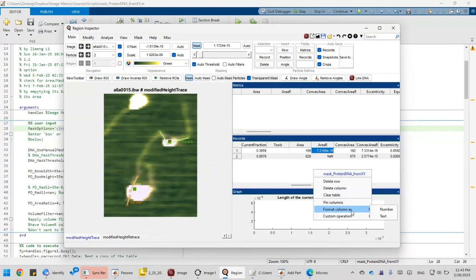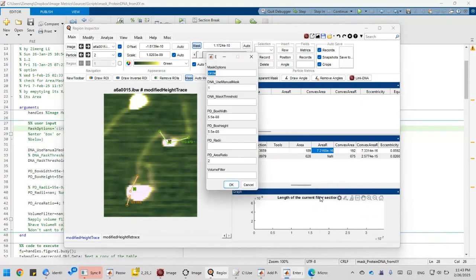Now, if you want to use the interactive version, and specify your parameters every time you add them to the particle set, you can simply click the interactive version. What it does is pop up the parameters for you. You can set these parameters that we just saw and click OK.